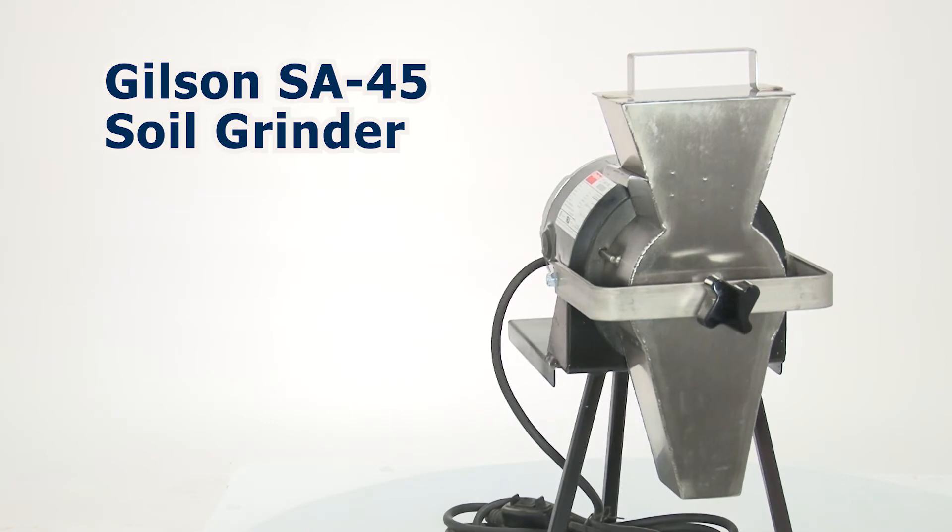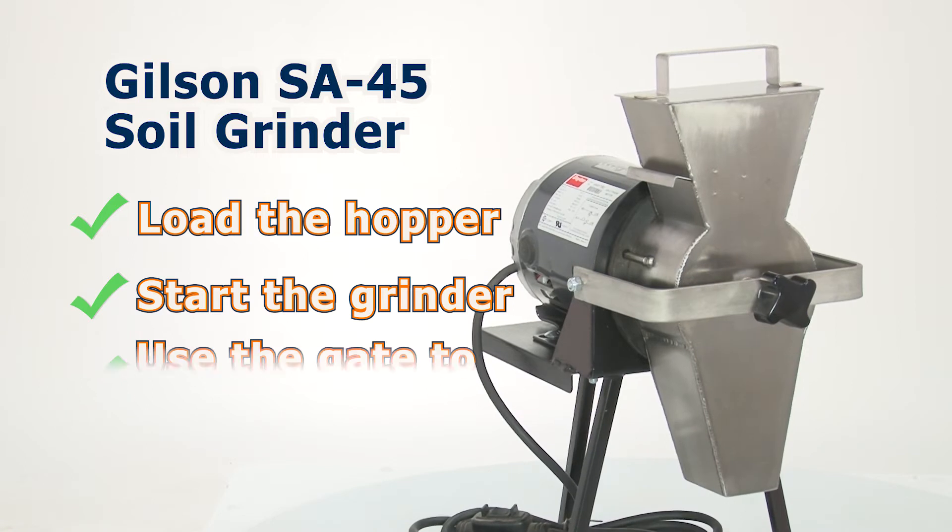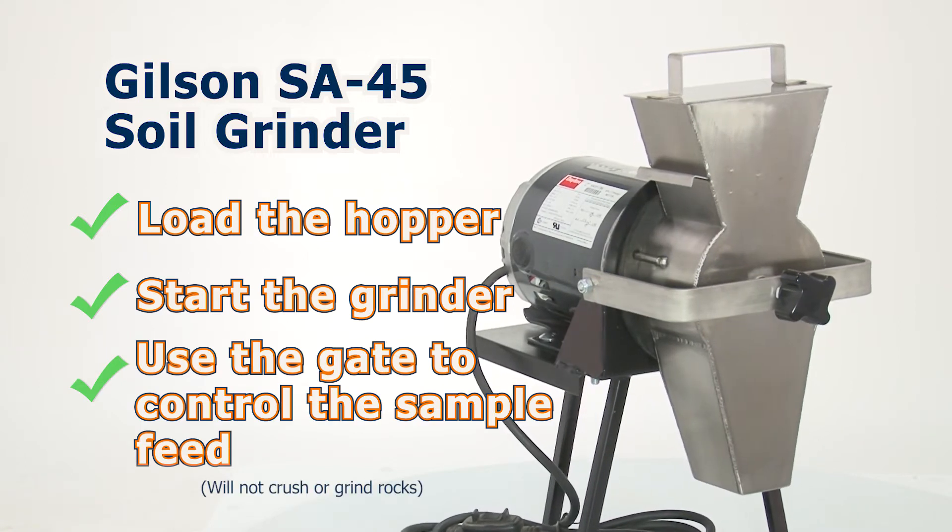Operation is simple. Just load the hopper, start the grinder from the inline switch, and use the gate to control sample feed.